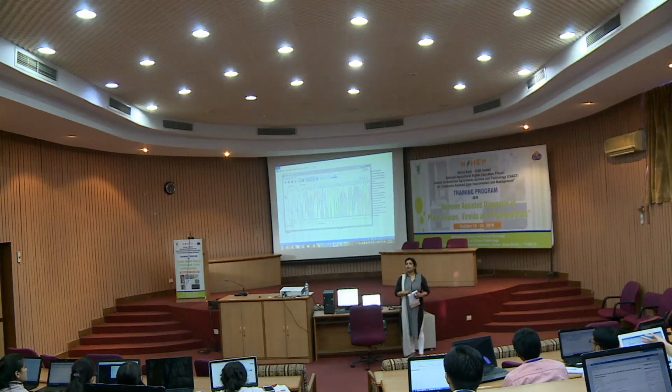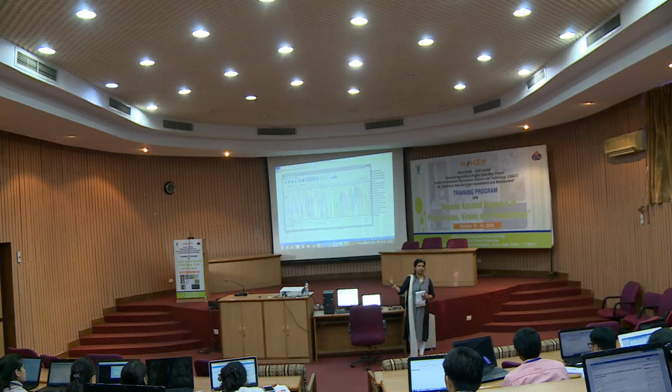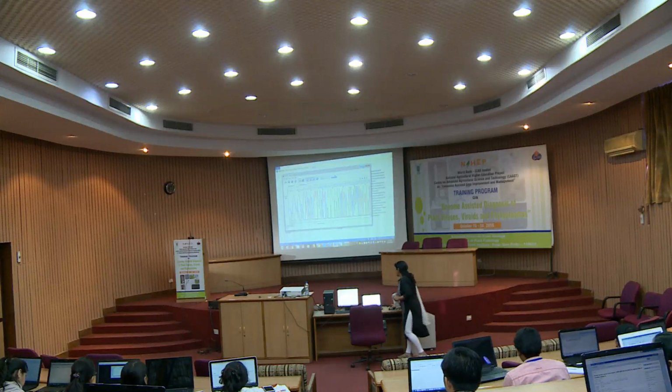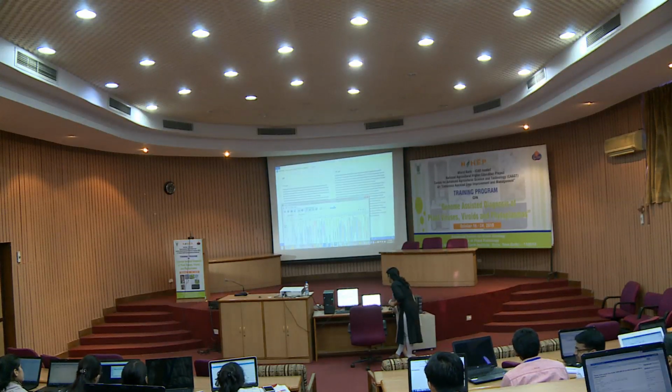Any doubts up to here? Can I move further? Okay, now once the contig has been formed, you have already saved that contig with you. Now you want to verify that all bases should be good enough. Suppose I had somewhere, okay, I'll make one contig. What I'll do, I'll try to pick some region.